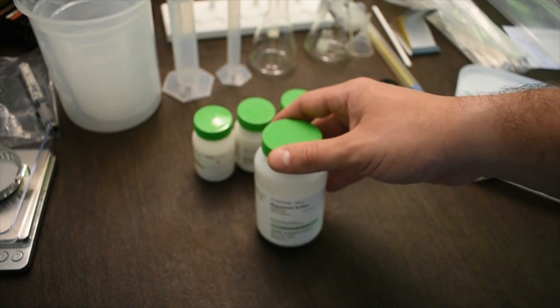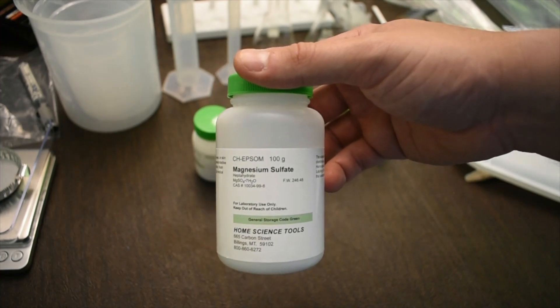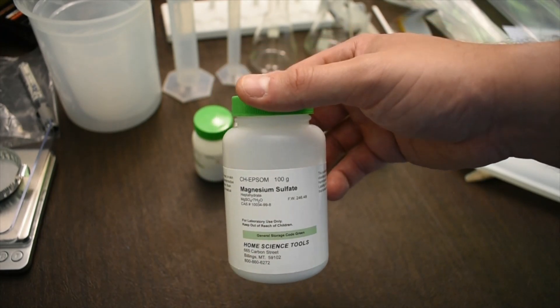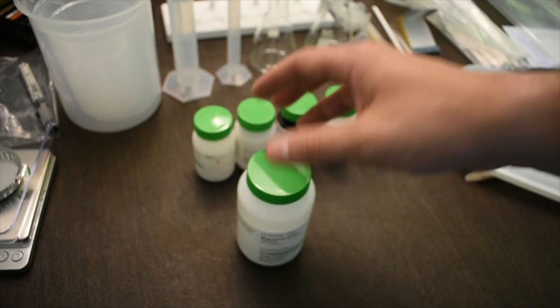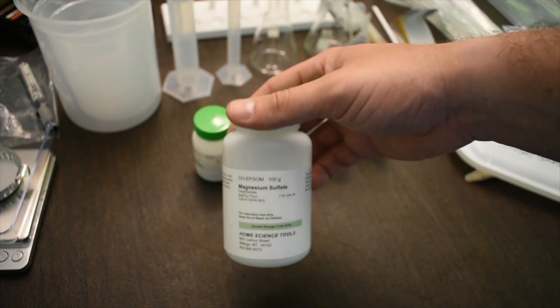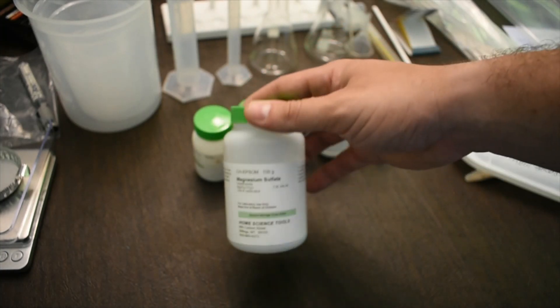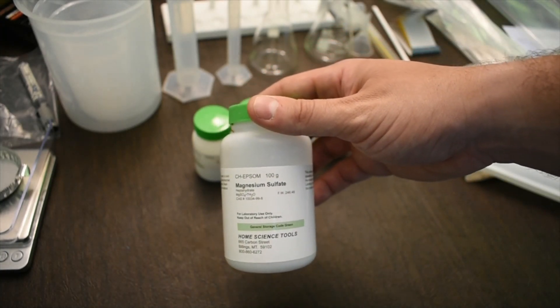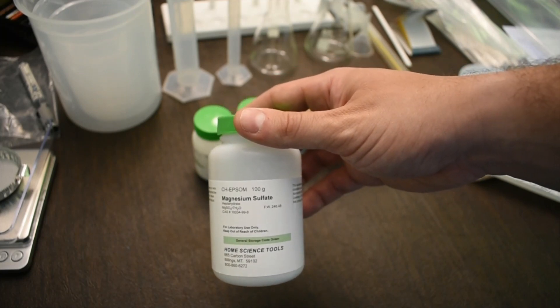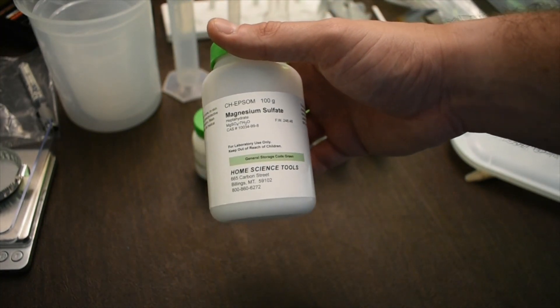The first chemical is magnesium sulfate, also known as Epsom salts, typically dissolved in bath water. The version in your kit is equivalent to Epsom salts and is about as safe as sodium chloride. You don't want to get it in your eye, and you should never eat or drink any of these chemicals, but it's about as safe as table salt.